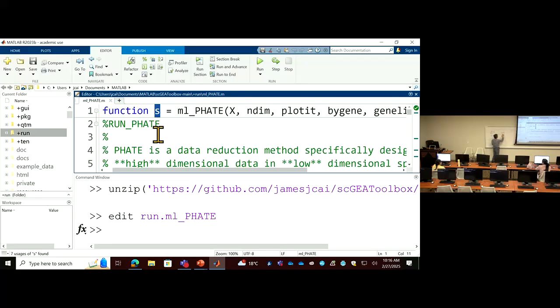Why? So this matrix called S, I use S as embedding. So its embedding is from this high dimensional space, that's M dimension, to 3D or 2D. So you reduce M dimension from here to 3D, and this is called embedding, reduced dimension.